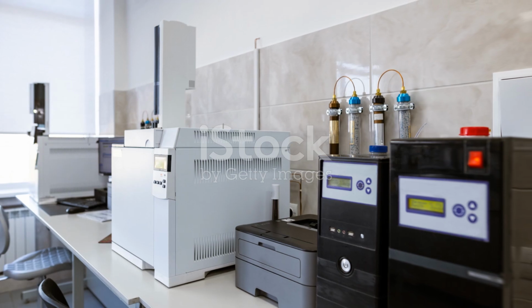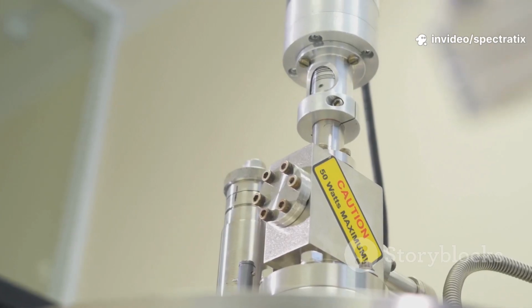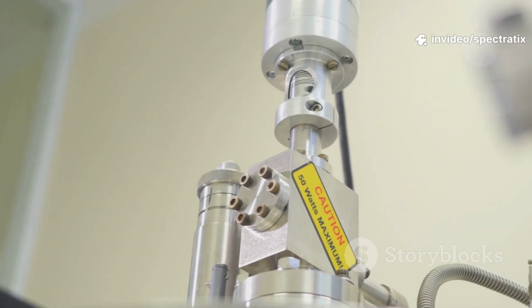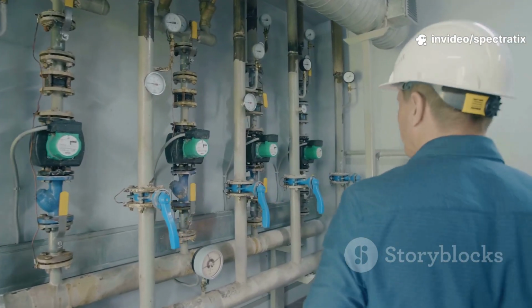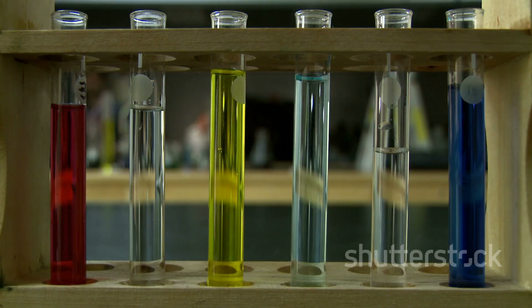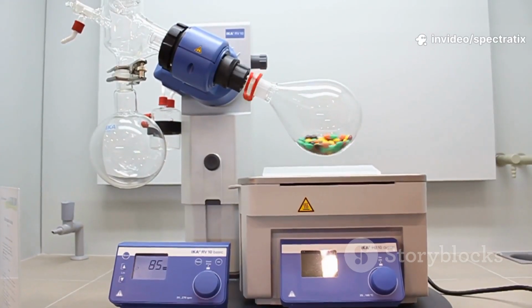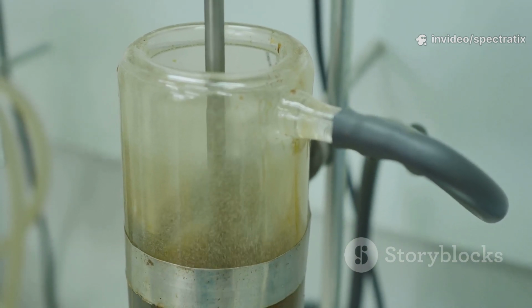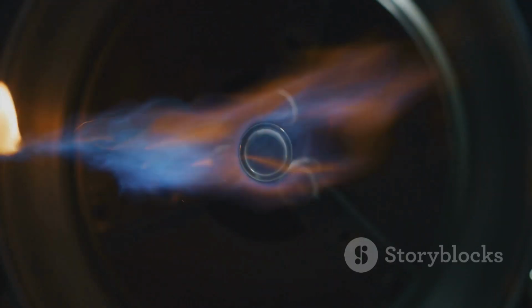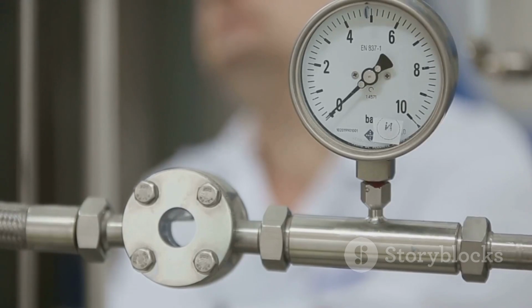First, the principle. Gas chromatography, or GC, separates compounds based on how they interact with a stationary phase inside a column, while being pushed along by an inert carrier gas. Think of it like a race. Each compound runs through the column at its own pace, depending on how much it likes to stick to the stationary phase versus how much it prefers to hang out in the gas phase. The more a compound interacts with the stationary phase, the longer it takes to reach the finish line. That's your detector. Now, on to the instrumentation.